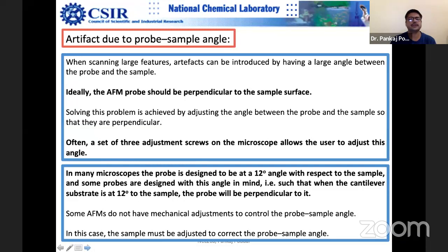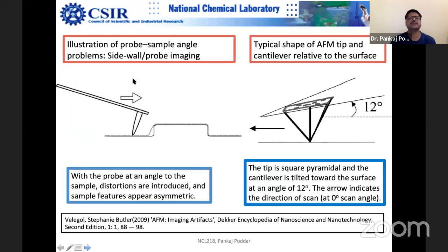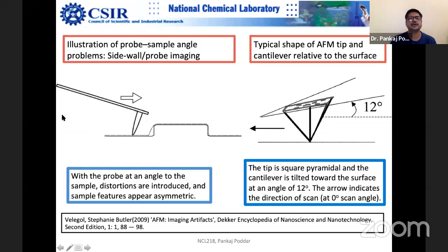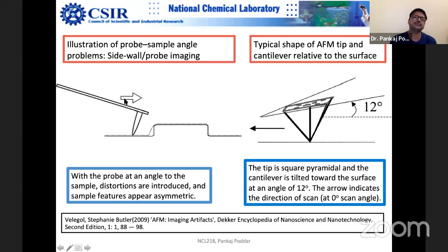Some examples: you can see a very sharp angle. The cantilever is not held horizontally — it is always at a certain angle, and this angle can be changed. One way is to modify the tip itself and make it sharper. Another way is to keep the tips the same but modify the mounting angle using the side adjustment screws. If the tip is moving this way, you can see it will interact with the sidewall, giving an asymmetric shape. One side is likely to be imaged properly but the other side will look slightly broad.